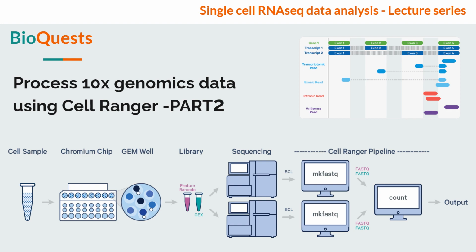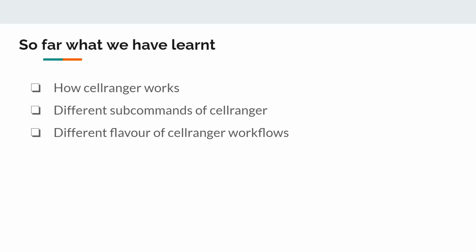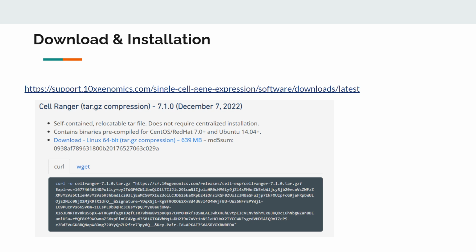data. Okay, so in the last video we talked more about the cellranger theory, like how cellranger works, and we saw different subcommands of cellranger and different flavors of cellranger workflow. So now in this video, we will mainly do the hands-on. So first step first, let's download the tool.